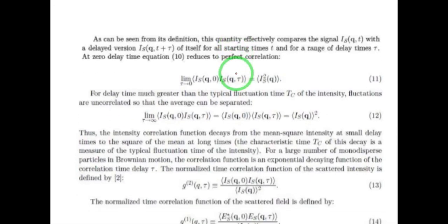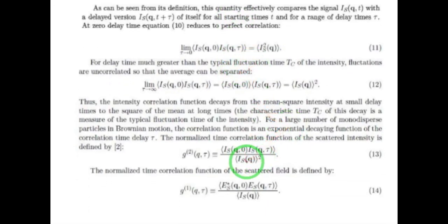However, the problem is that we have to normalize it, and I told you before that we introduced the normalized form, the power form, with the power of 2, which will help us to get more precise information about the size distribution.